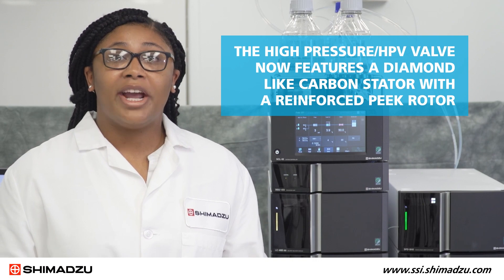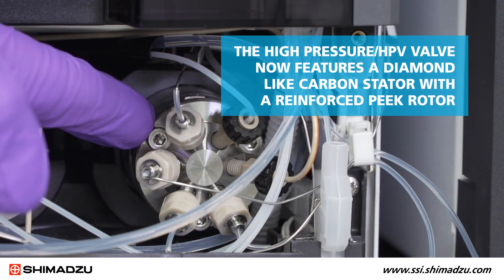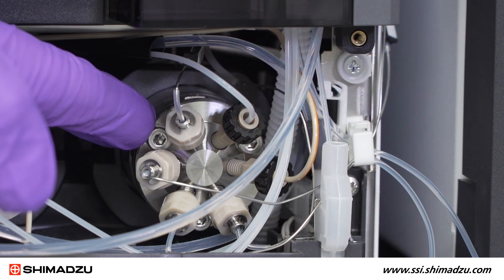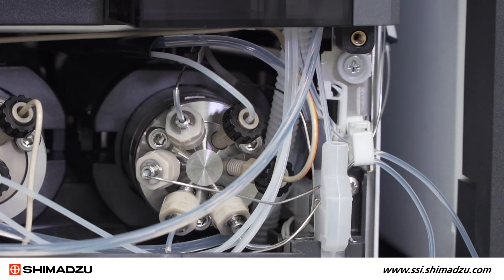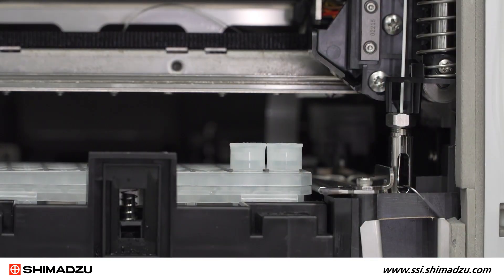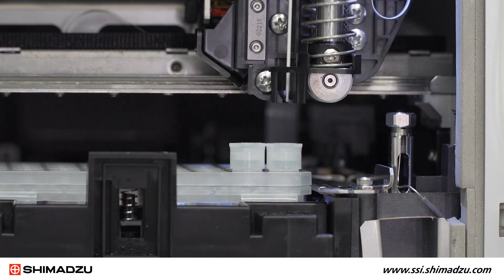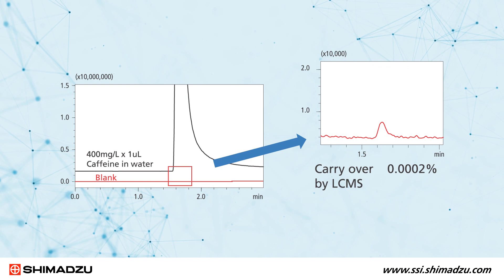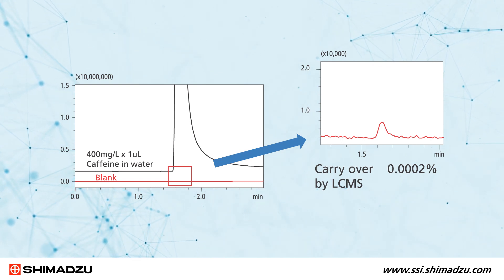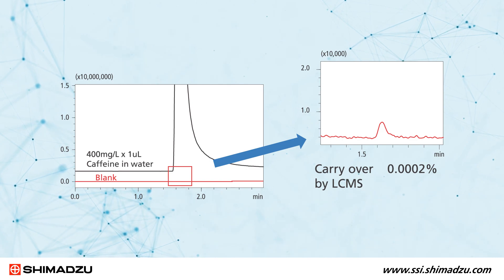The high pressure, or HPV, valve now features a diamond-like carbon stator with reinforced PEEK rotor. PLS and inert tubing are used to plumb the auto sampler. Inside the auto sampler, we see the ceramic needle that has replaced the standard metal needle typically used for drawing samples. Shimadzu's 40 series auto samplers have the best-in-class carryover, high-speed injection operation, and air temperature control.